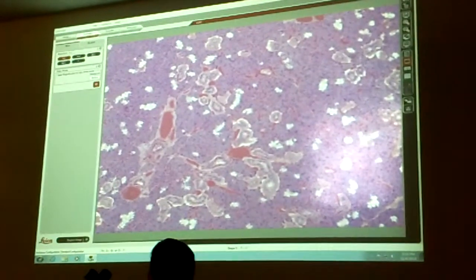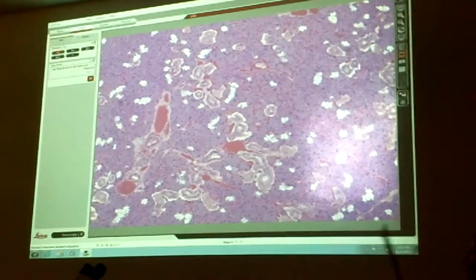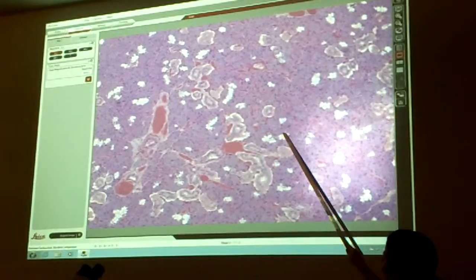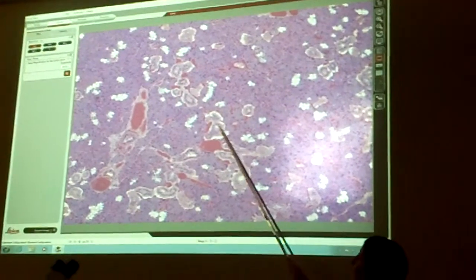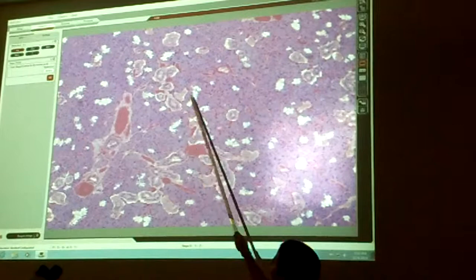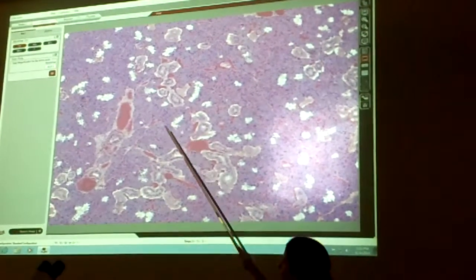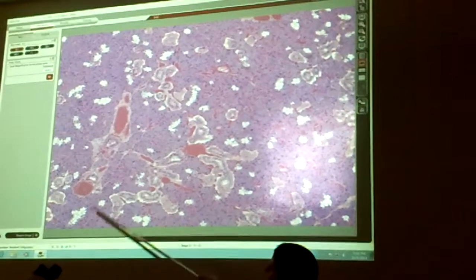And a lot of times people want to say that those swatches are adipose, but they're not adipose because you can see there's nuclei in here. These little edges are nuclei. So they're not adipose. So what are these again? Salivary ducts. These things? Mucus acini. They're actual individual cells clumped together. And all of these cells in the background? Serous acini.